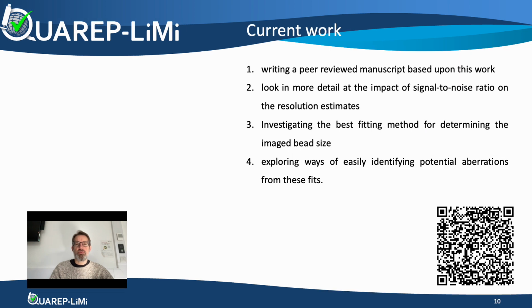Our current work is focused on 4 activities. First, writing a peer-reviewed manuscript based upon this work. Second, looking in more detail at the impact of signal-to-noise ratio on the resolution estimates. Third, investigating in more depth the best fitting method for determining the image bead size. And fourth, exploring ways of easily identifying potential aberrations from these fits.